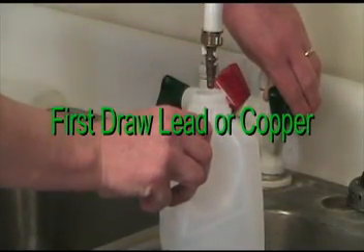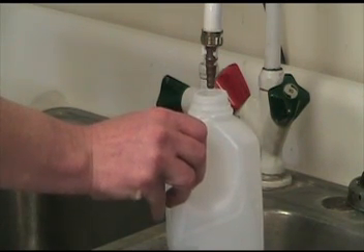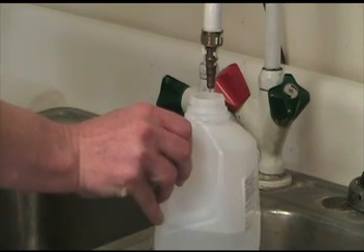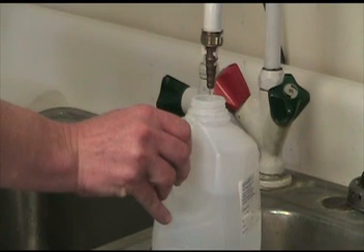When testing for first-draw lead, collect the very first drops of water by holding the bottle under the tap prior to turning on the cold water. Do not use cold water for at least 6 hours before sampling for first-draw lead. When sampling for first-draw lead, collect 1 liter of sample.